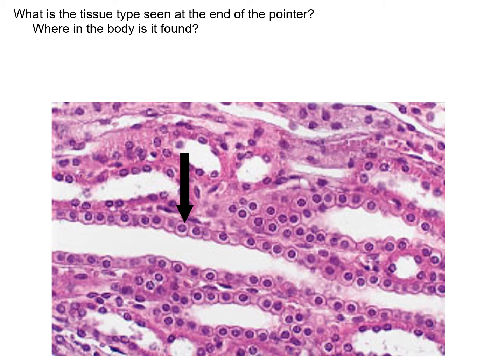Yesterday, I told you about the salivary glands. And there was a picture where there was a duct from a salivary gland that also had simple cuboidal epithelium.